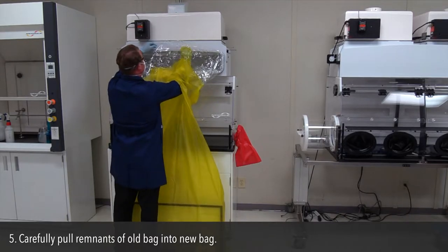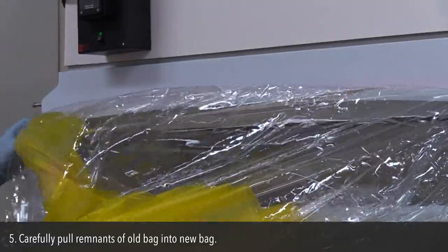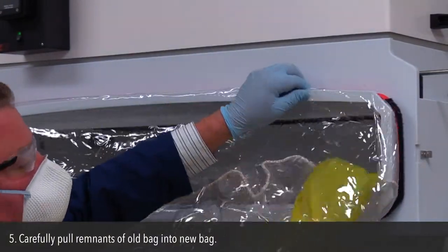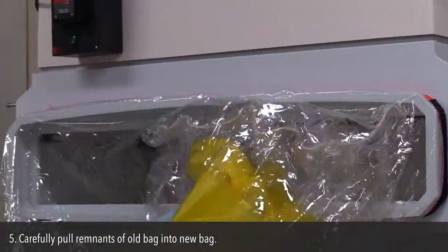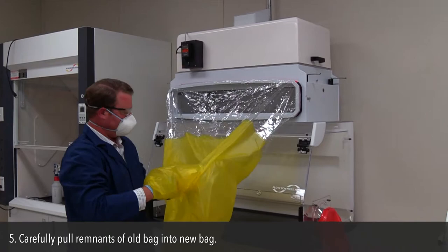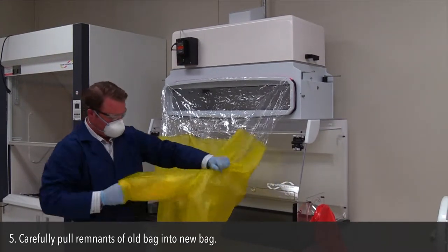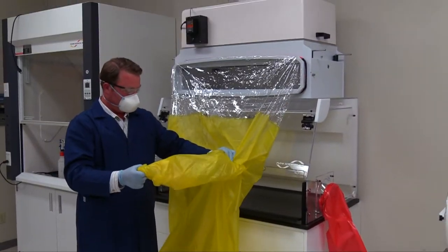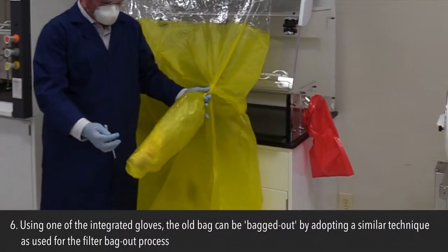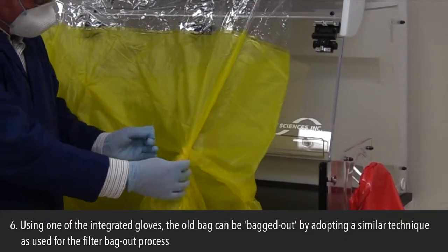Step 5: Carefully pull remnants of the old bag into the new bag. Step 6: Using the integrated gloves, the old bag can be bagged out by adopting a similar technique as used for the filter bag out process.